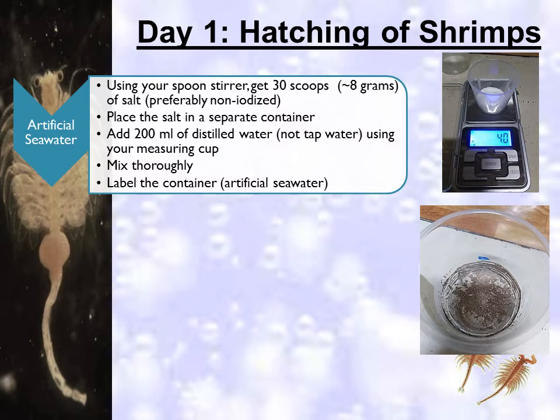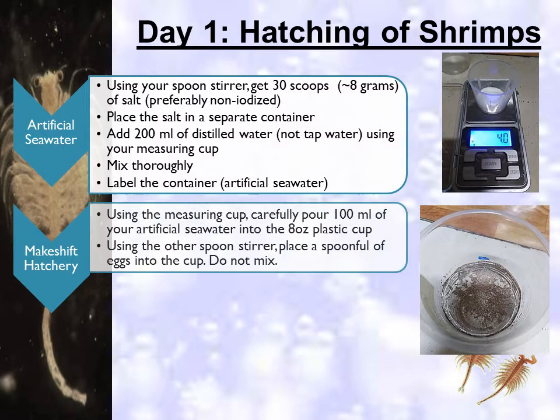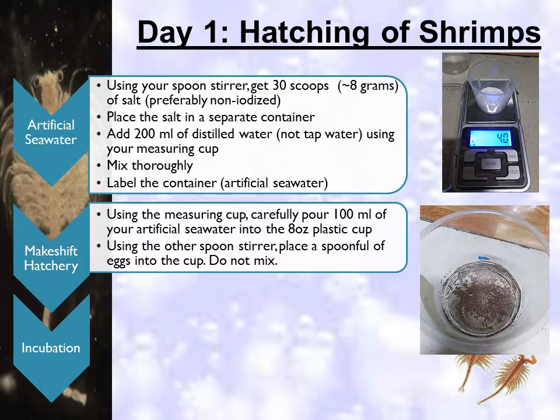To set up the makeshift hatchery, using the measuring cup, carefully pour 100 ml of your artificial seawater into the 8 oz cup. Using the spoon stirrer, place a spoonful of eggs into the cup. Do not mix, and make sure the spoon stirrer you use is dry. For incubation, use the lid of the brine shrimp kit to cover the 8 oz cup hatchery. Let the eggs hatch for 20 to 24 hours.